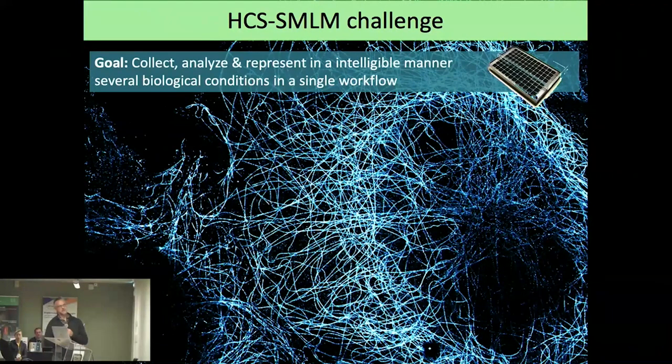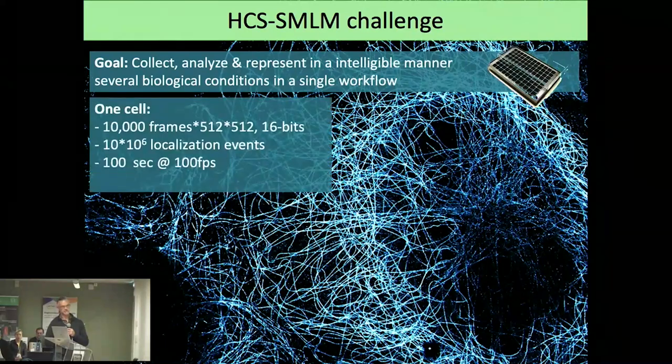So the challenge, and we ended with this solution, was trying to combine high-content screening, which is really a completely automated fashion to collect, analyze, and represent several biological conditions in a single workflow, which is a lot, because you know this technique is pretty time-consuming and quite strict in terms of requirements and quality of the image.